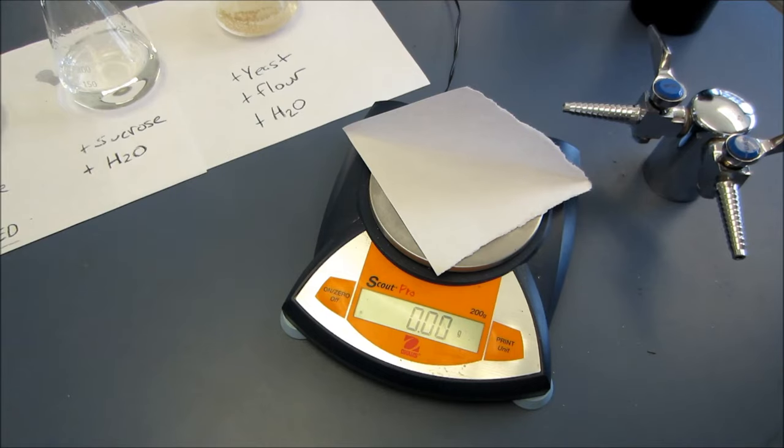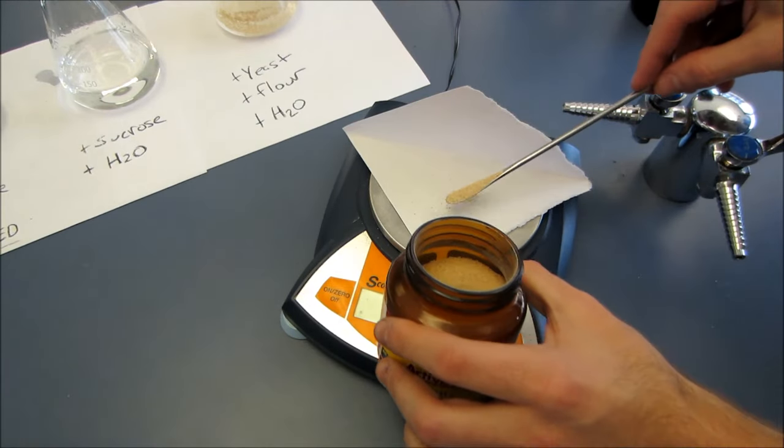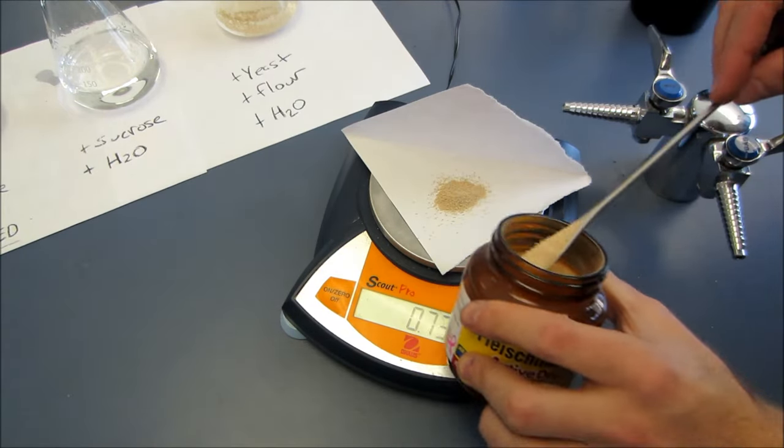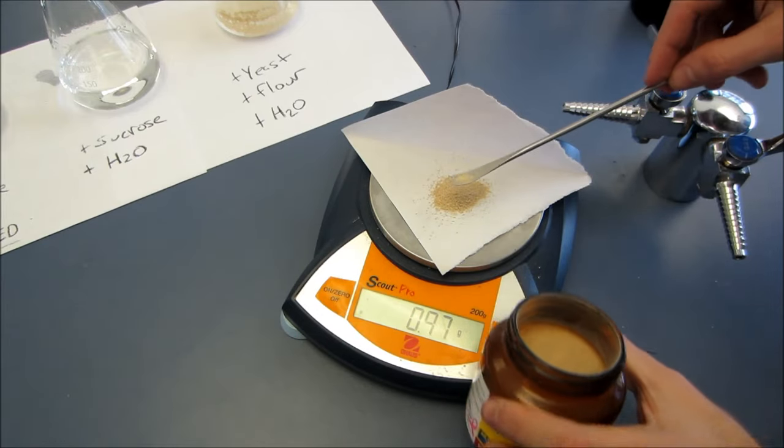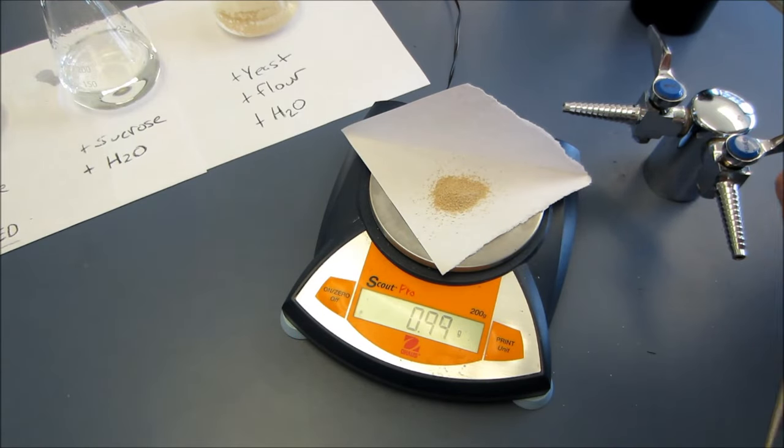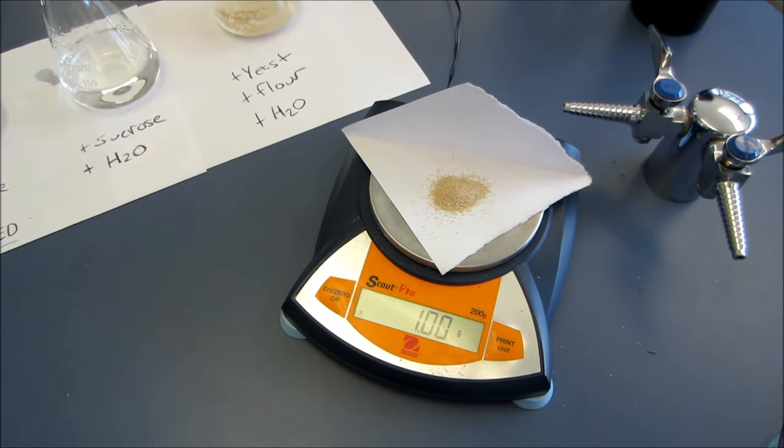It comes coated in a freeze dried food coating so that it stays fresh. You can just keep it on your shelf until you need it and then when you dissolve it in water the yeast will become active. Their coating will dissolve and they'll emerge and start doing their thing.